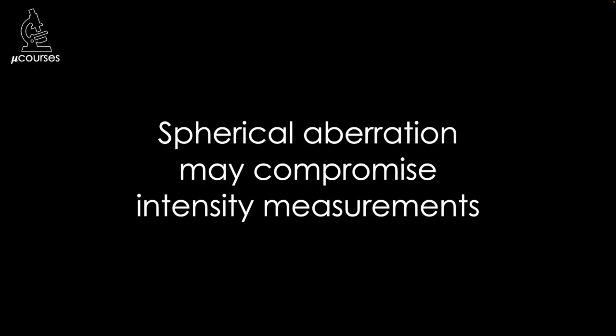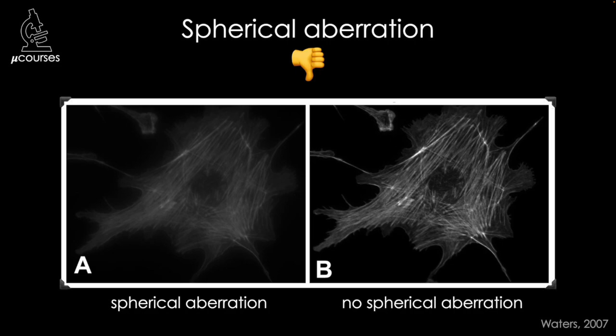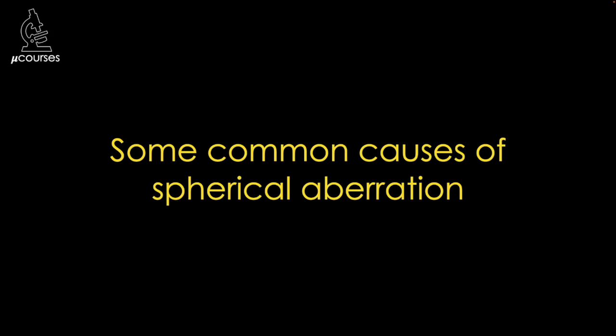The presence of spherical aberration may compromise the accuracy of some intensity measurements. But even if you're not making intensity measurements and your experiment doesn't require maximum resolution, spherical aberration just makes images look bad — and it's not always obvious that image quality is suffering until you've made the effort to look for it and reduce it. I want to emphasize that these are both wide-field fluorescence images; all I've done is reduce spherical aberration in the image. Let's discuss some of the common causes.